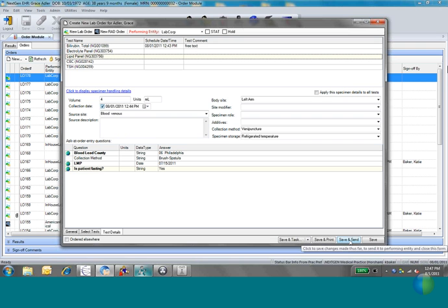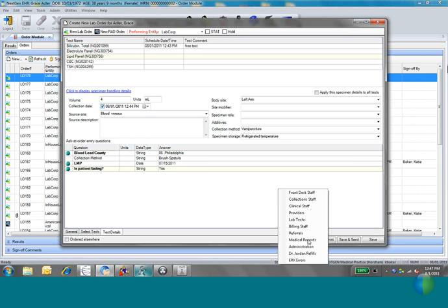If you hover, it even says, click to save changes made thus far to send it to the performing entity and close this form. That's the only button that sends it to the vendor. Save and Task saves your changes, but you can send a task to any of your work groups. So what I have here are all my individual work groups.